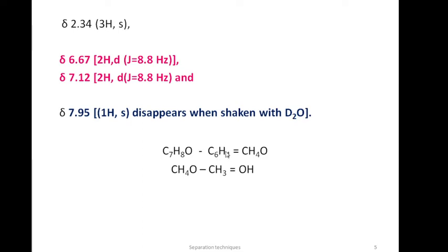You have CH3 corresponding to these 3 protons, and 1 OH corresponding to 1 proton here. So now we have C6H4, CH3 and OH.